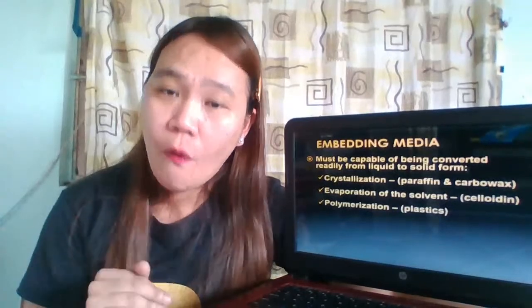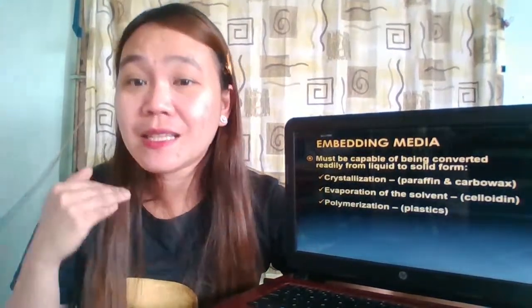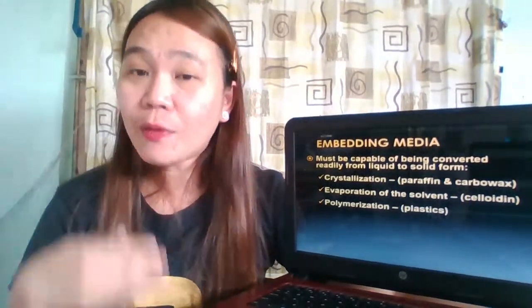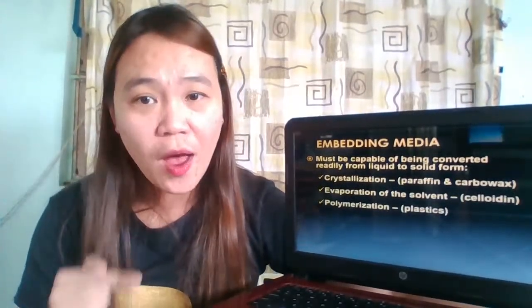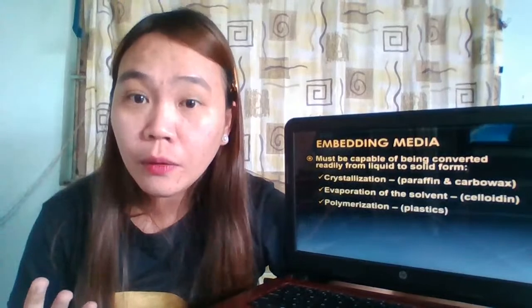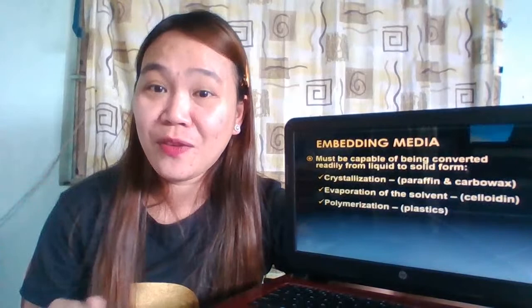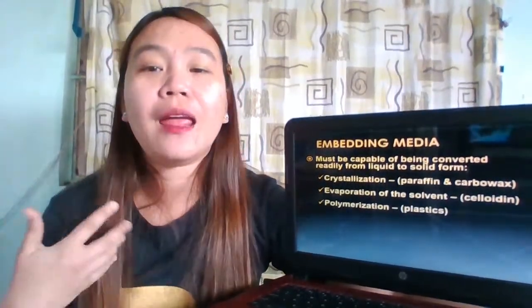So why is it the most important characteristic? Because the liquid form of your embedding media is important during the infiltration process. How are you going to infiltrate your tissue sample if it is not in liquid form? That's why in the laboratory, right before our classes got suspended, we melted our paraffin, because we want it to be in its liquid form for infiltration.